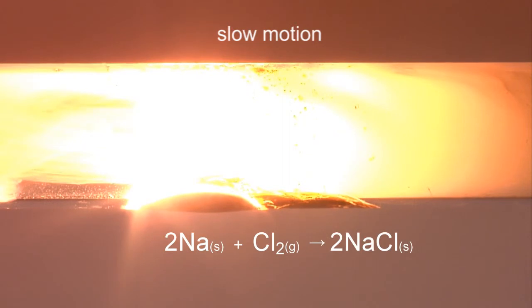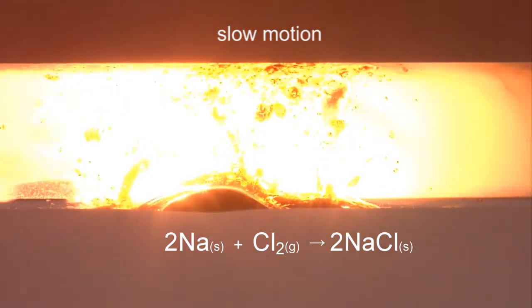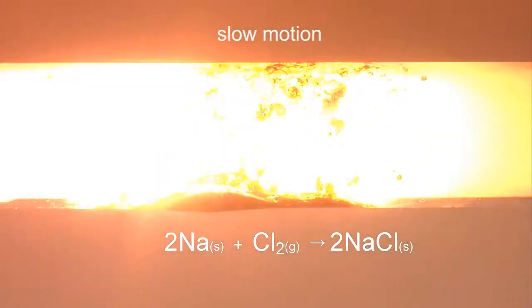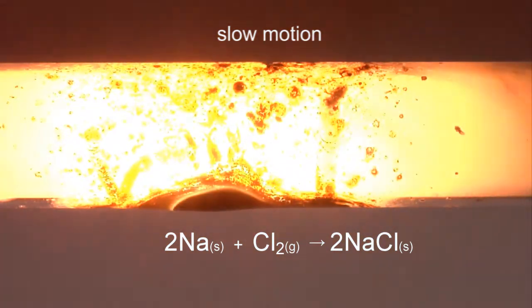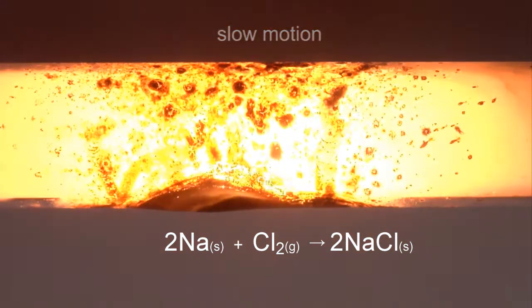This highly exothermic reaction produces enough energy for sodium to displace boron and silicon from the glass. The black material which contains boron and silicon is fused within the molten glass.